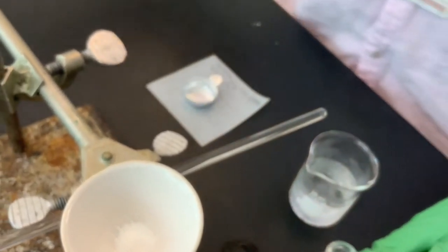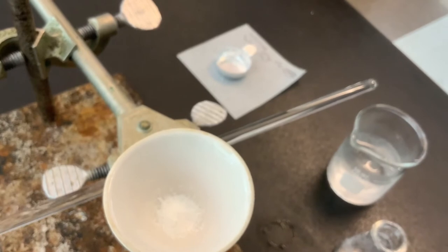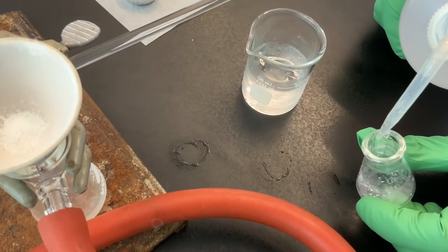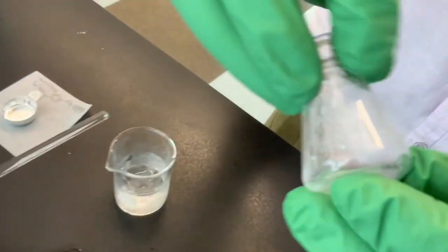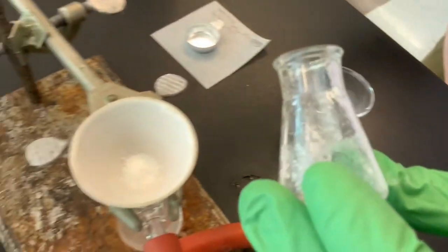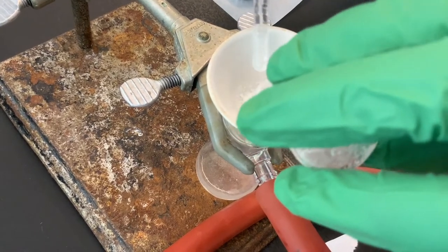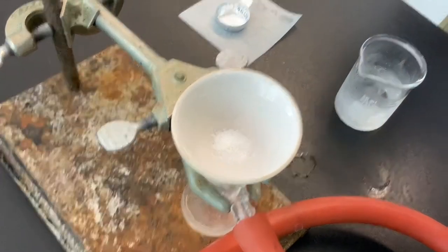So I'm just going to use a little bit of deionized water. I don't want to use too much, so hopefully my... Yeah, so that's good, right? And I'm going to just try and collect all of the stuff that's on the sides, and use my glass stir rod to help push out the stuck benzocaine. And at the same time, what this is doing is it's going to wash the solid there of any residual base.